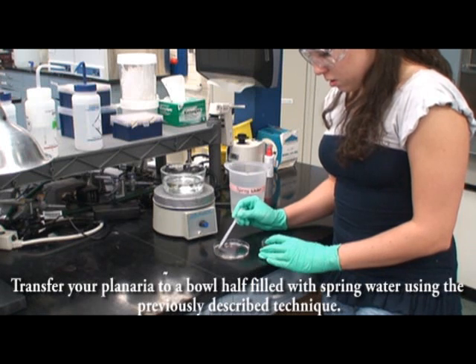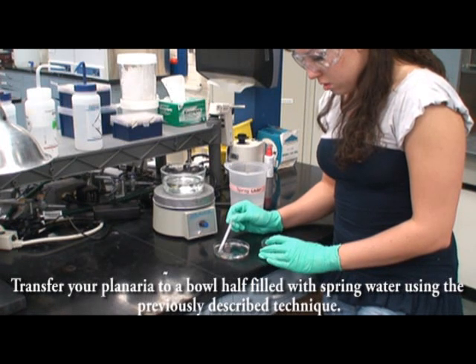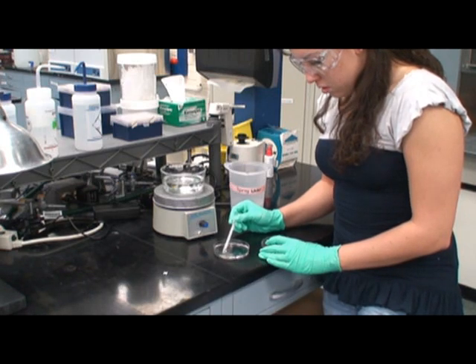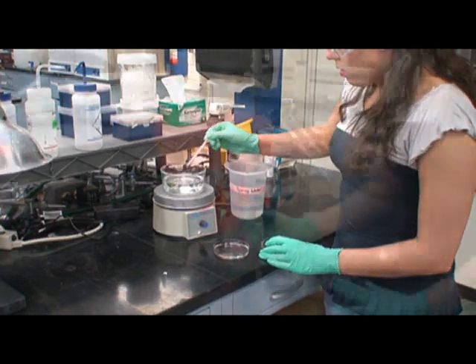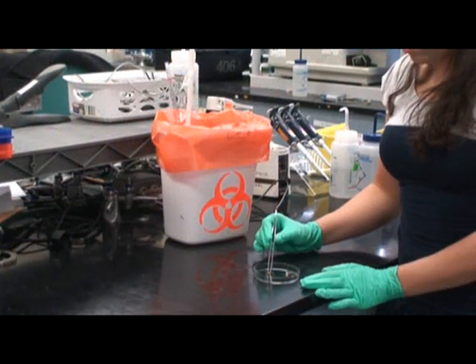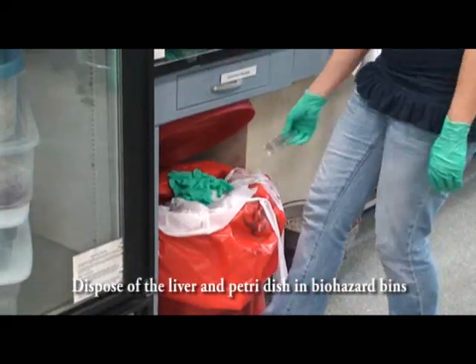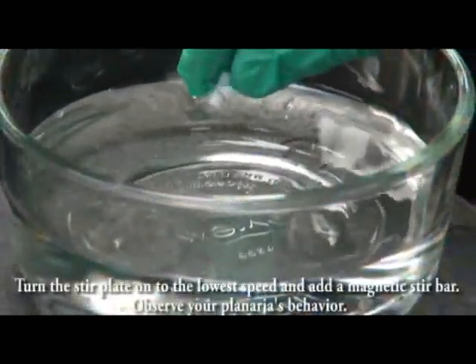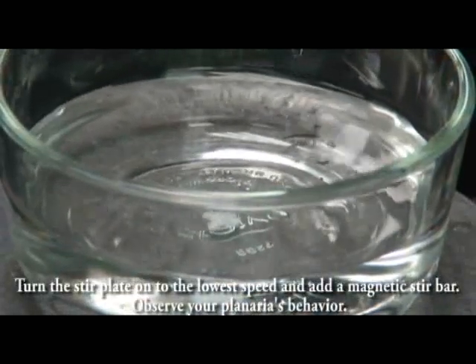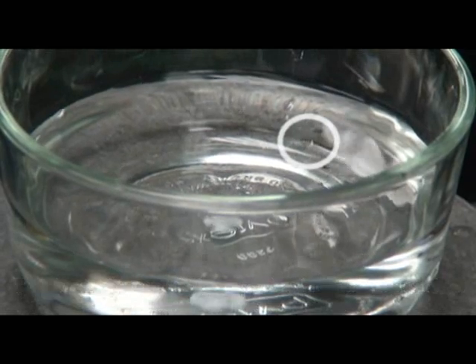Transfer your planaria to a bowl half filled with spring water using the previously described technique. Dispose of the liver and the petri dish in the biohazard bins. Place the bowl on a magnetic stir plate. Turn the stir plate on to the lowest speed and add a magnetic stir bar. Observe your planaria's behavior.